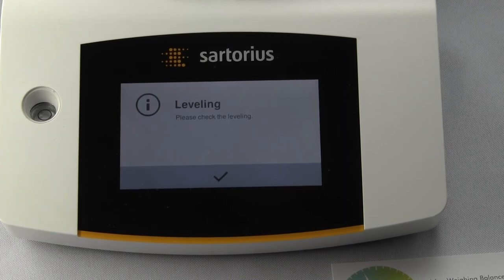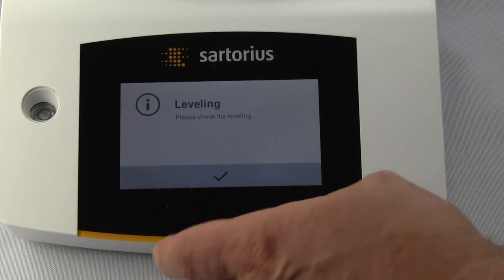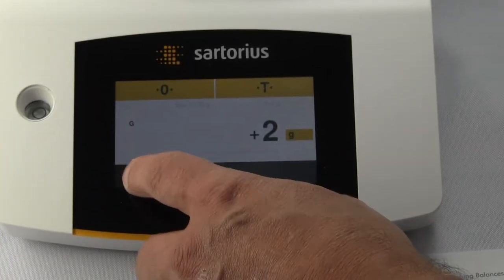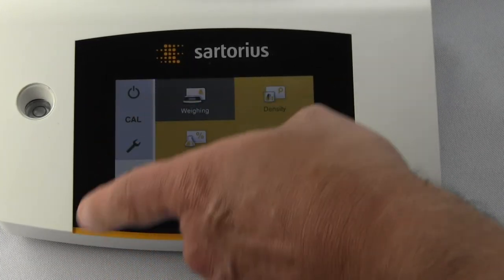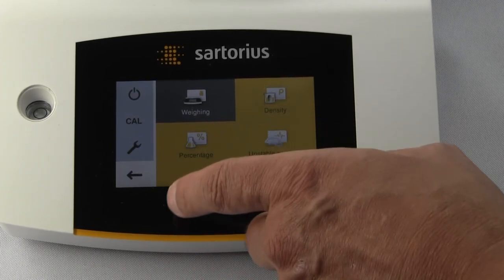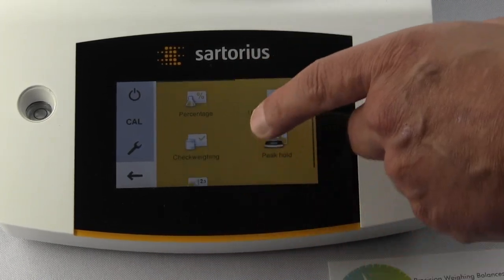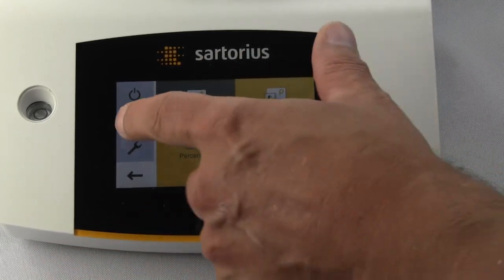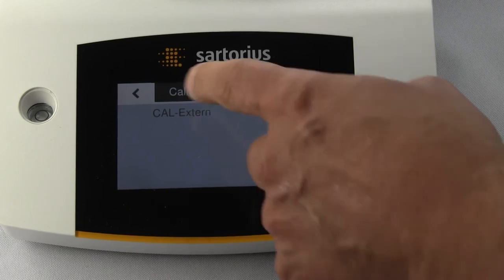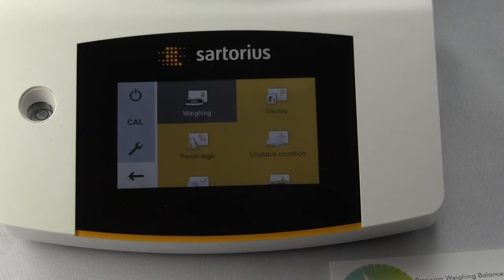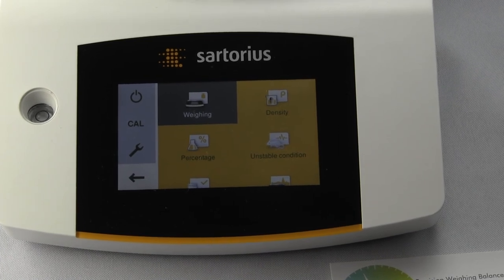Now that it's level you simply hit okay. I've made a couple videos regarding the menu—it's extremely intuitive, a nice touch screen display. If you want to get into calibration, you have your cal mode. It's external cal only, and I've made another video on that.